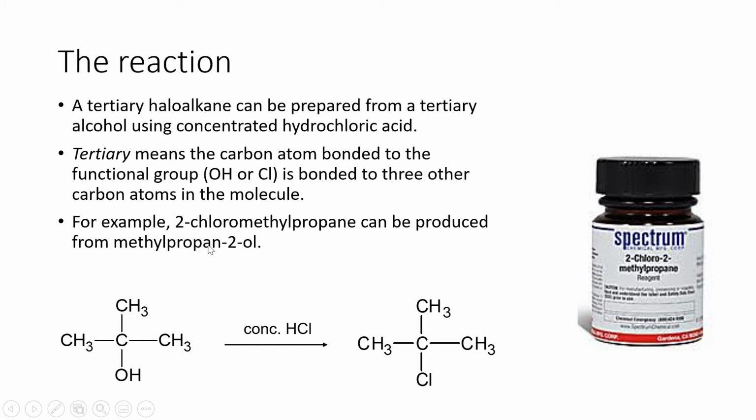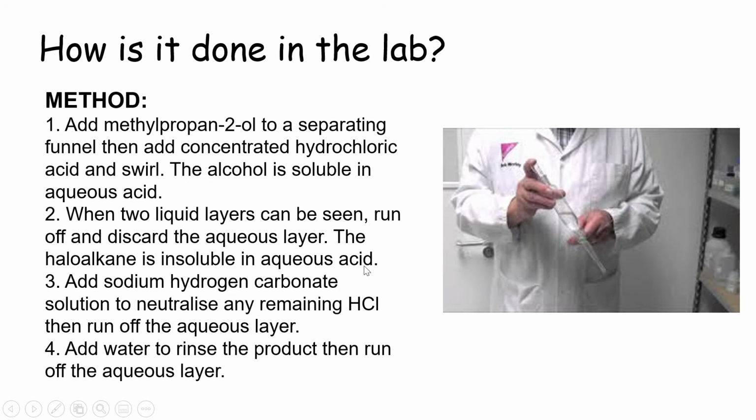In this example, we're going to use methylpropan-2-ol to prepare 2-chloro-2-methylpropane, the haloalkane. Here's the method.